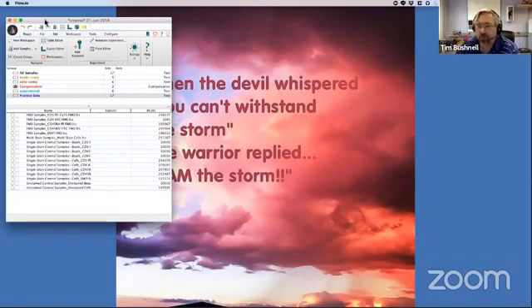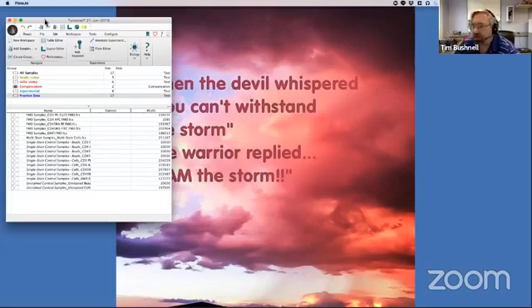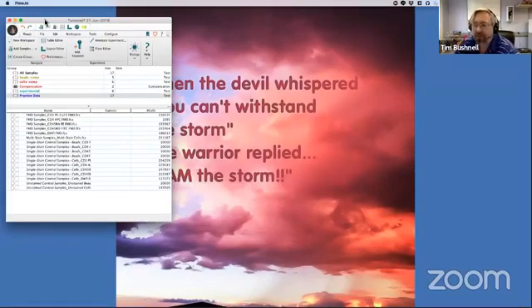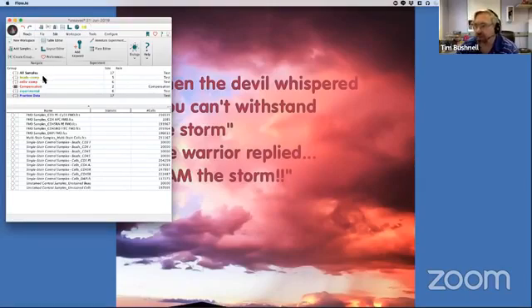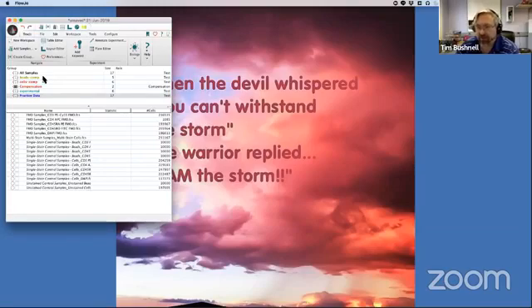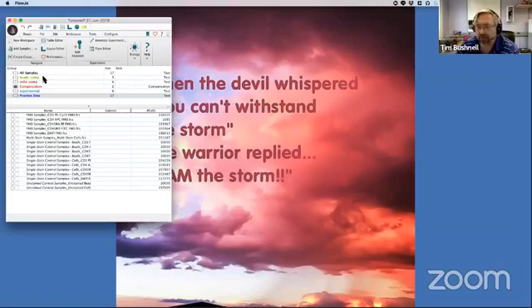What I have done is I've uploaded a data set that I use, and if you want this data set, email us at support at expertcytometry.com and ask for the data set, and I can send you a link to it. I like using this data set because, as you'll see, we use both beads and cells for compensation. It's a five-color experiment for fluorochromes and DAPI as a viability dye.